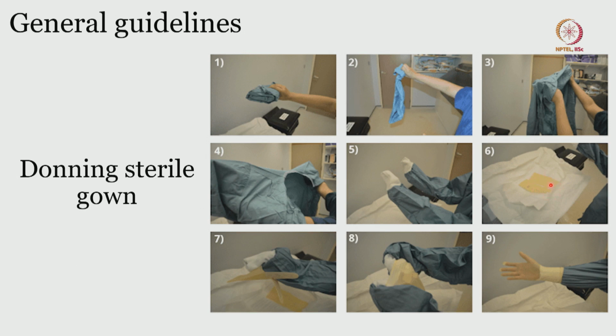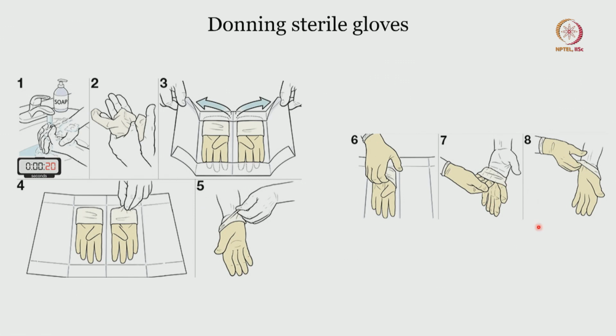So in order to keep the gloves 100% sterile, this is one way of handling it, where you use your hand with the cuffs of your sleeve being held in place, and then you handle it to wear one glove. Once one of the sterile gloves is worn, the other can be handled easily. This is a bit difficult. I would suggest you can wear the sleeves completely, provided your handling of the gloves is done in a very specific fashion, such as shown here.